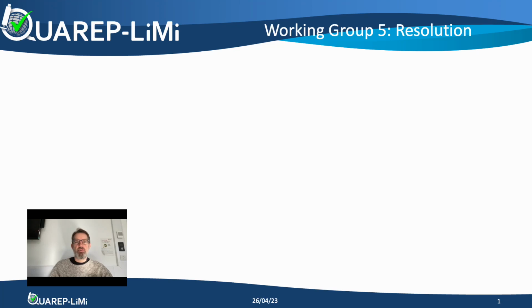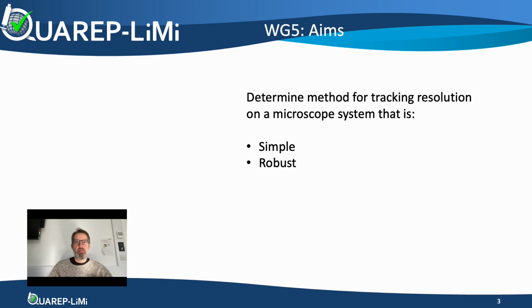Hi, this video introduces you to Working Group 5 of QUAREP-LiMi. We are tasked with identifying the simplest, most robust method for tracking the resolution of a light microscope system.